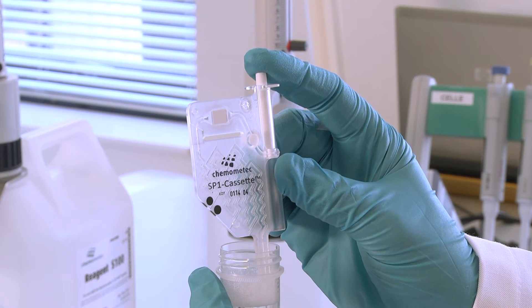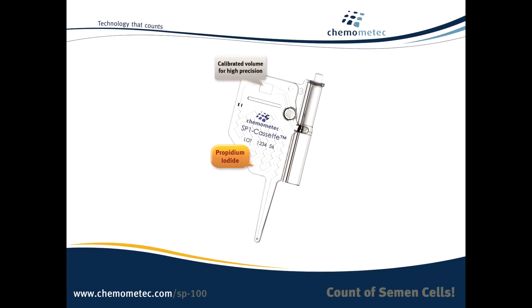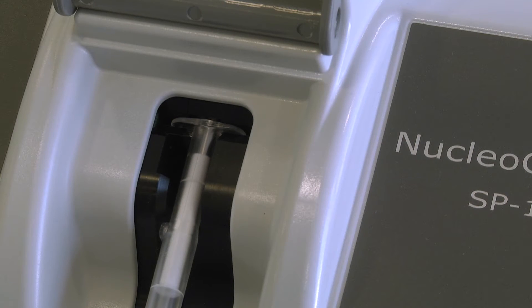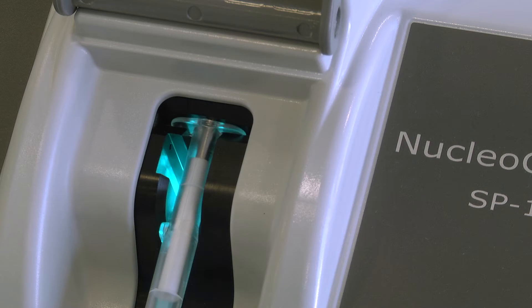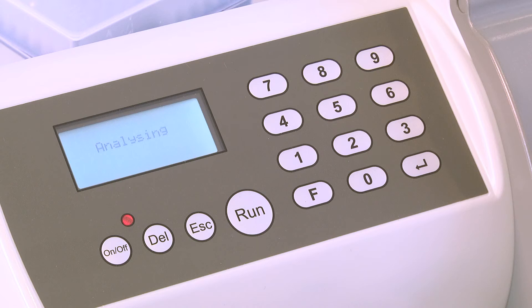Load the cassette with the diluted sample by pressing the plunger. The sample will be drawn into the cassette and mixed with the staining agent, propidium iodide. Insert the cassette into the instrument and press RUN. The instrument will push the plunger down, forcing the sample through the mixing channels and into the measurement chamber in the cassette. Light shines through the chamber and the emitted light from the nuclei is captured by a camera chip. The resulting picture is analysed and the cells counted.